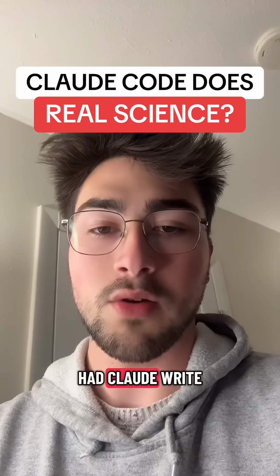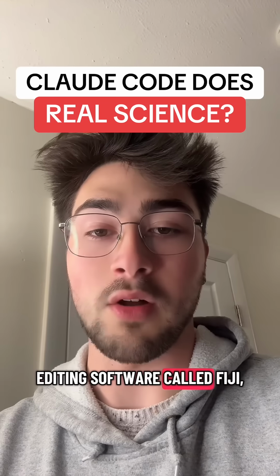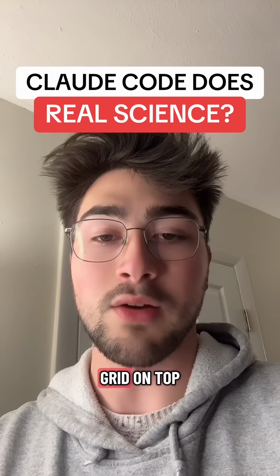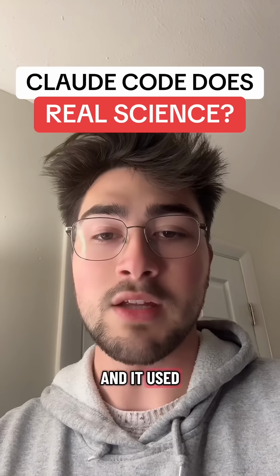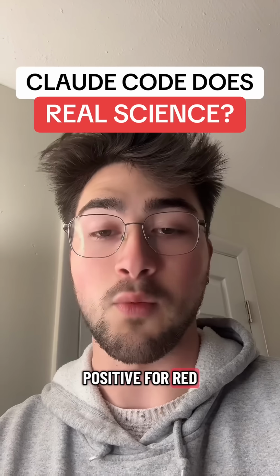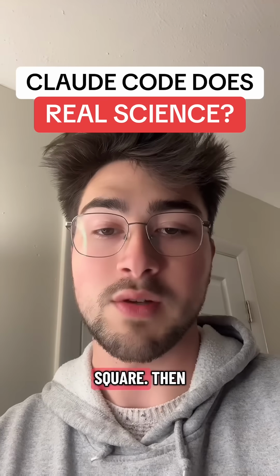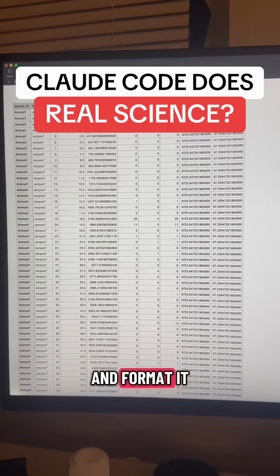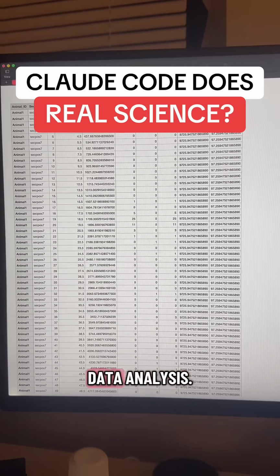To do this, I had Claude Code write me a script for an image editing software called Fiji, which if you're a scientist, I'm sure you've used before. And essentially the script created a grid on top of the tissue section, and it used the brightness of the pixel values in the picture to count how many cells stained positive for red or green proteins within one grid square. Then I prompted Claude Code to extract the data from Fiji with a Python script and format it nicely into a table for easy data analysis.